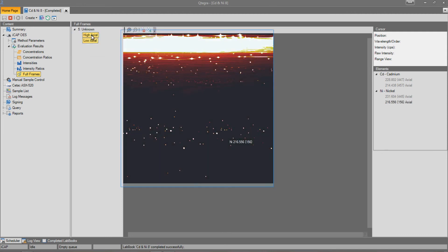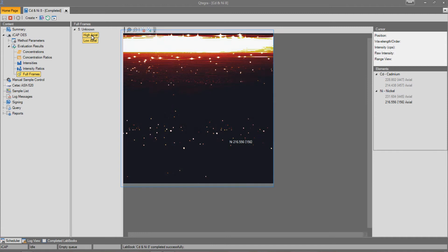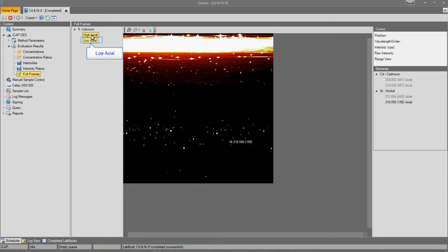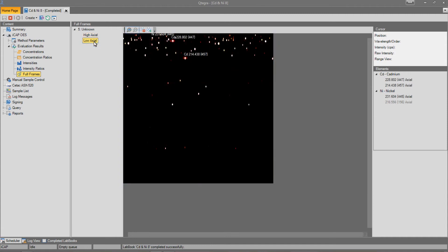Let's have a look at the high-axial. Here we can see the full-frame image of the high-axial view. Now let's have a look at the low-axial.